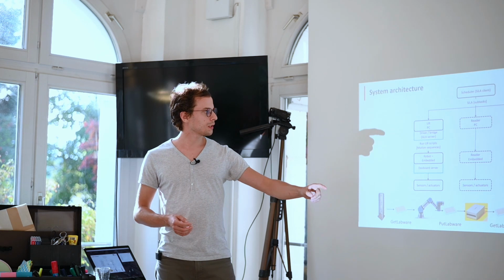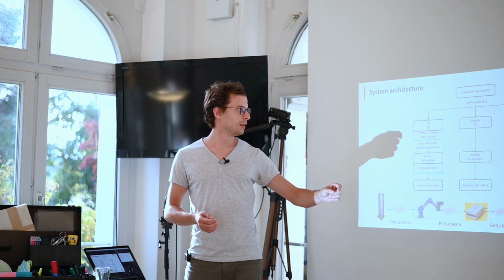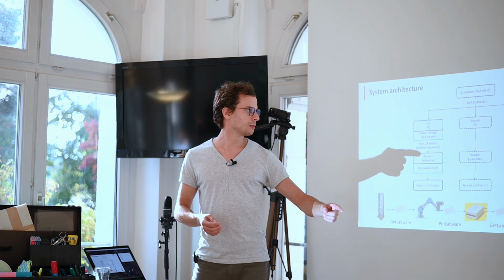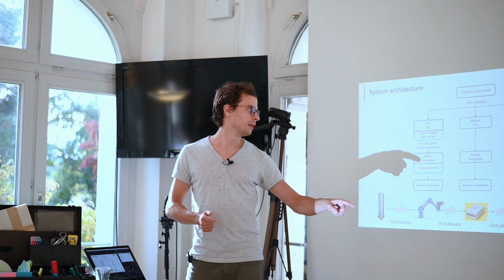As I said, on the UR side, we implemented the driver or the bridge as a SiLA server that basically just calls certain motion sequences that are implemented on the robot level.